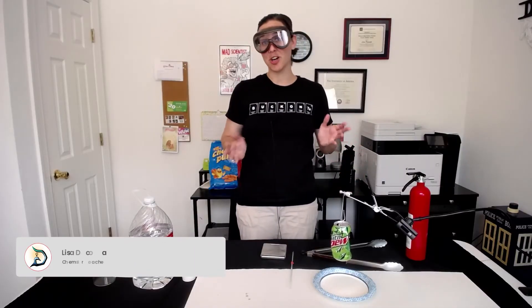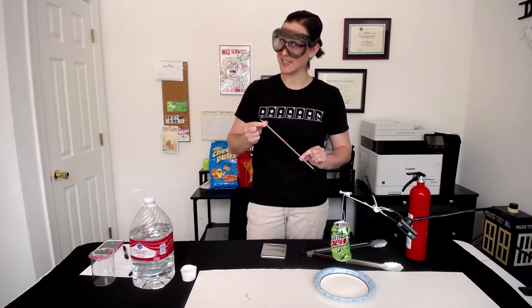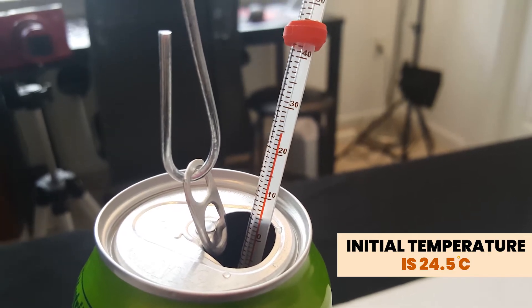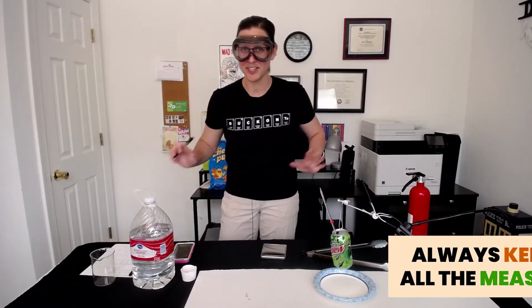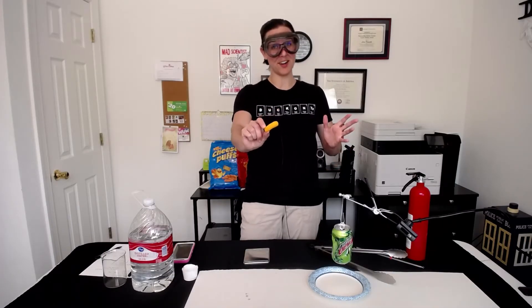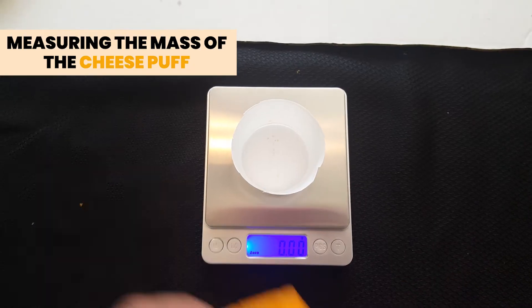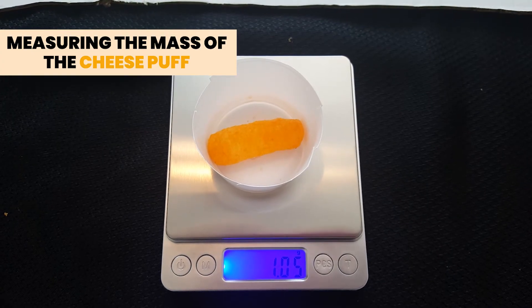Now we need the initial temperature of this water before we light anything on fire underneath it. Make sure you take your temperature reading in degrees Celsius since that's the unit we need when we're doing our calculations. Our initial temperature is roughly 24.5 degrees Celsius. Make sure you write down this initial temperature. The next thing we need is the mass of our cheese puff before we light it on fire. Make sure you're putting your snack item in a weigh boat since there's lots of grease and oil that we don't want to get on our scale. Looks like we're starting with an initial mass for the cheese puff of 1.05 grams.